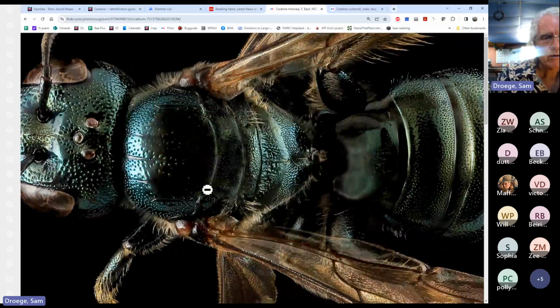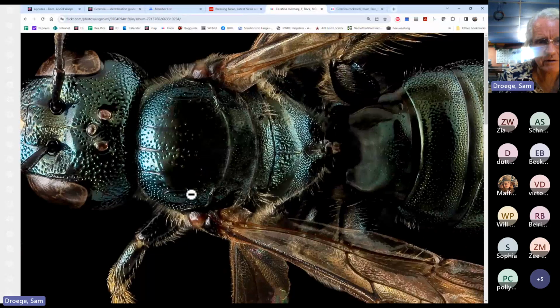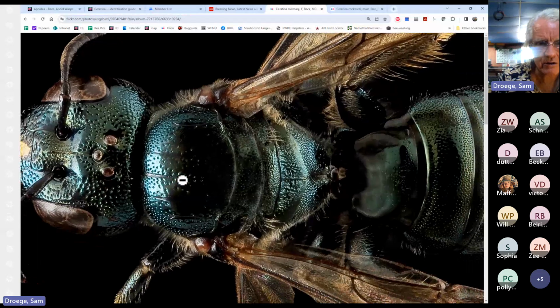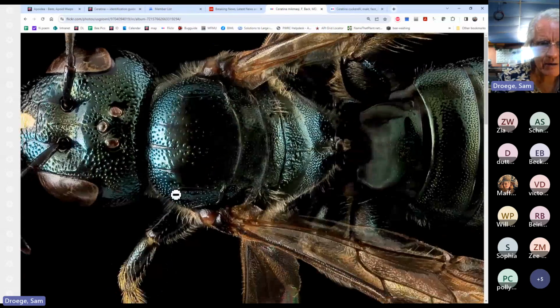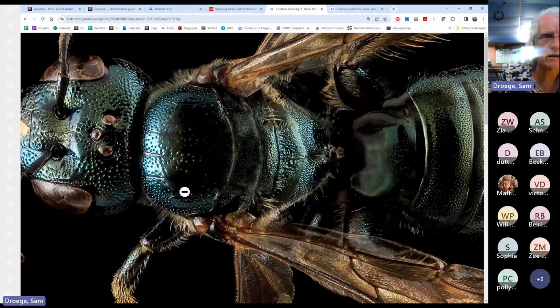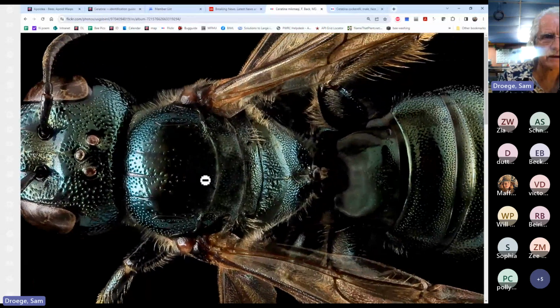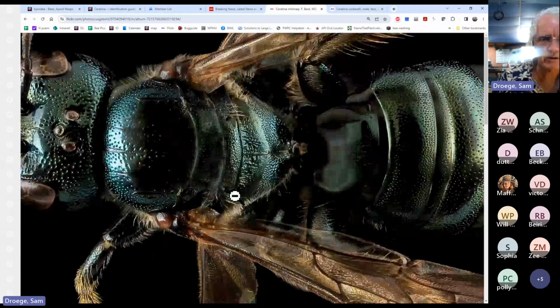When we look here, we're looking at the scutum, and we'll bring up another picture. Here are the parapsidal lines; I think Sandra calls them notauli. Here's the other parapsidal line. These are just recessed suture lines, like there's the central one. Along these parapsidal lines there are only a few pits, and sometimes spaces with no pits whatsoever. Then there's a relatively large open area with no pitting. The central line has pits running down it on either side, and it's repeated on the opposite side, symmetrical.